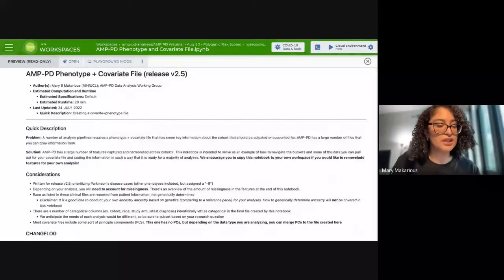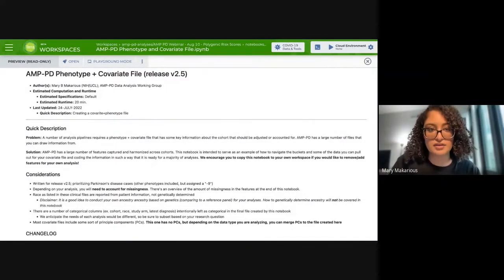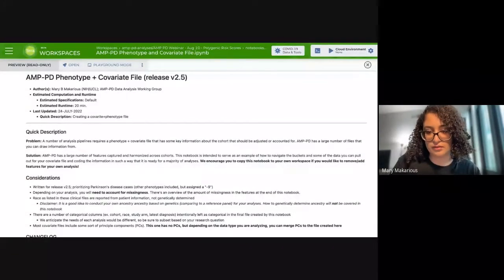So our first notebook here, maybe I'll pause here in case anyone has any questions before I deep dive into the first notebook. I can't see the chat. Okay.